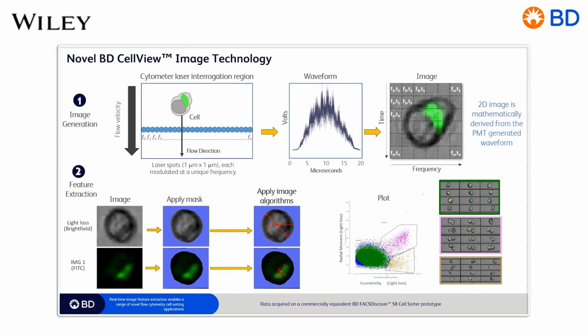Looking at that figure on the top left, if you imagine the laser beam, the blue laser, the view you're looking at is the laser coming right at you. We take that laser beam and we split it. Half of it goes to the APD array and is for spectral detection, and the other half is for the imaging. The imaging is only available on the blue laser. That blue laser is run through what's called an AOD, or acousto-optic deflector.